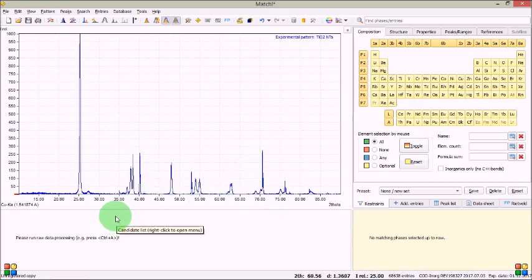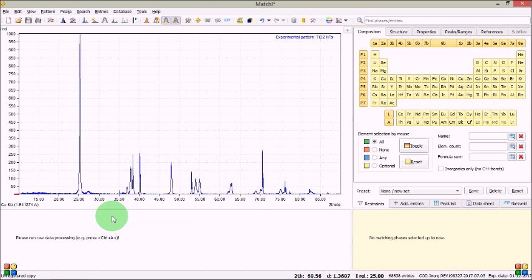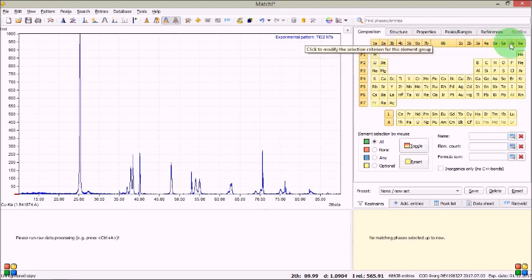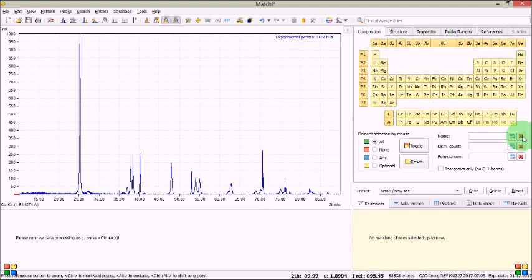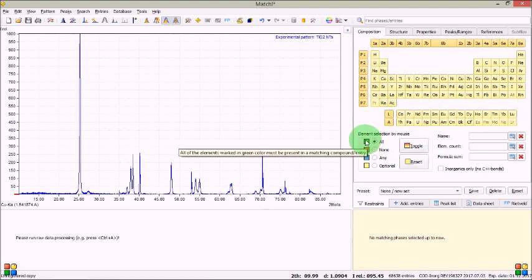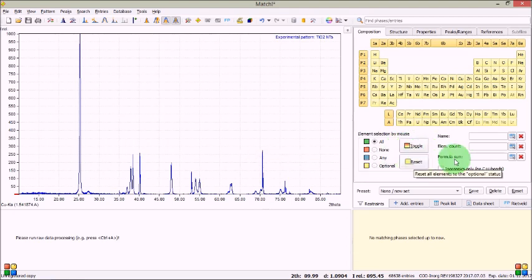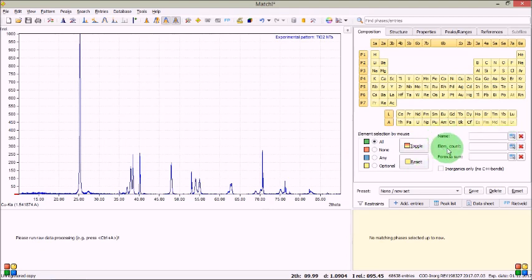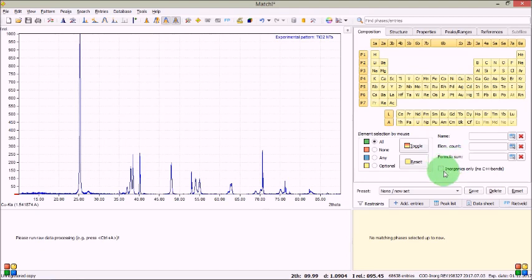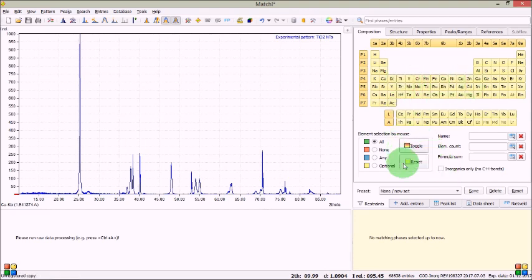Now my task is to find the XRD peaks for TiO2 which I expect will be anatase and there will be some peaks for titanium as well coming from the substrate underneath. So you can see the periodic table is here. Lots of options element selection by mouse all none any optional and you can do toggle reset options and name of the element element count formula sum everything is there and if you have no organic compound in your sample then you may also check in this box. It will consider only inorganic samples and reduce the options. So let's try with first of all TiO2 okay.